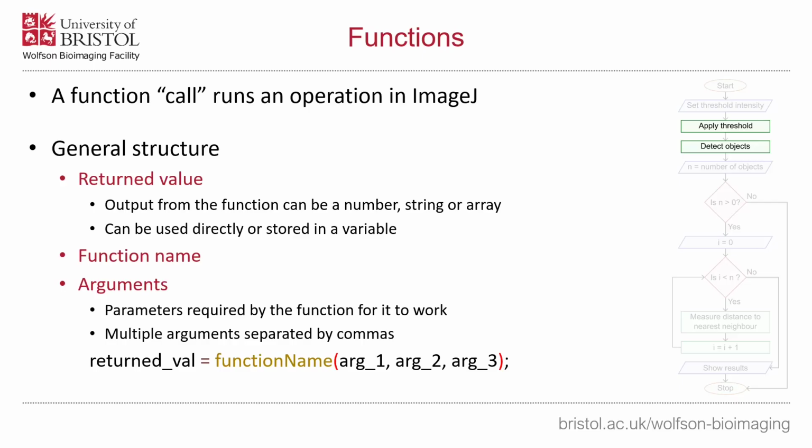So now that we understand the various ways that we can store data actively within the macro, we can start looking at processing operations. As in my demo previously, or the flow diagram, we could consider these to be things like applying thresholds or detecting objects.